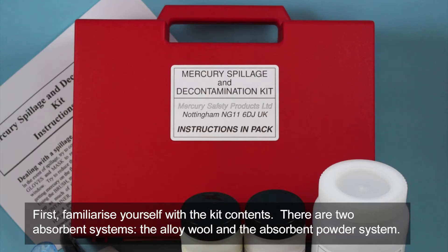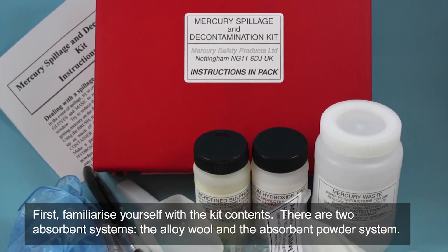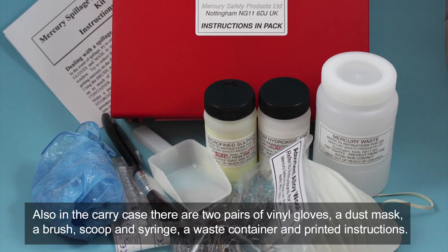First, familiarise yourself with the kit contents. There are two absorbent systems: the alloy wool and the absorbent powder system. Also in the carry case there are two pairs of vinyl gloves, a dust mask, a brush, scoop and syringe, a waste container and printed instructions.